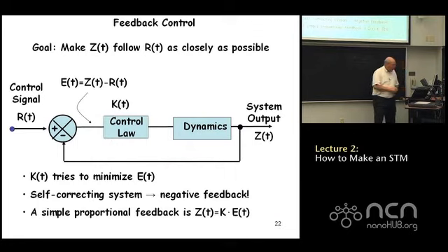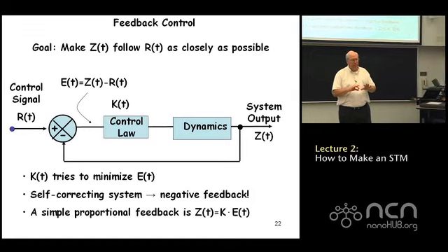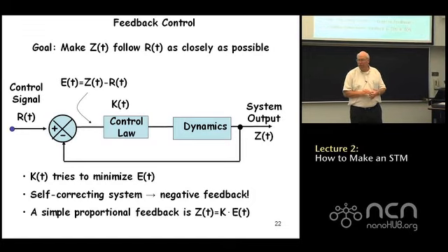We're not going to talk much about feedback control in this lecture, but it's going to be an important issue in atomic force microscopy. This slide is just to introduce you to the concept, because it's going to come back later in a lot more detail.